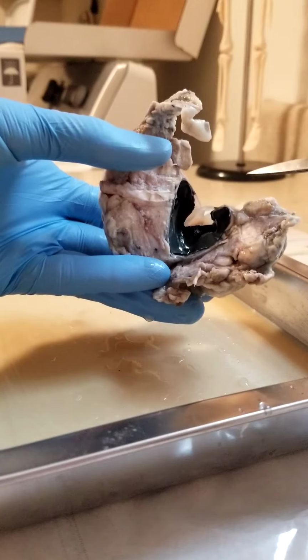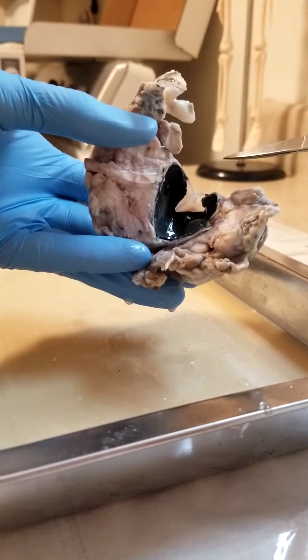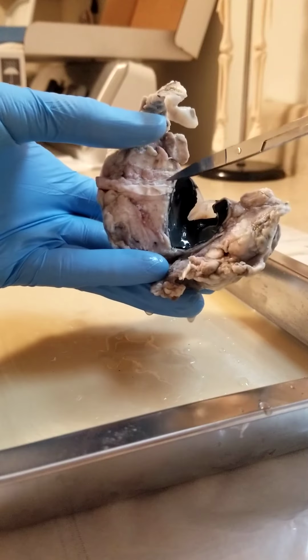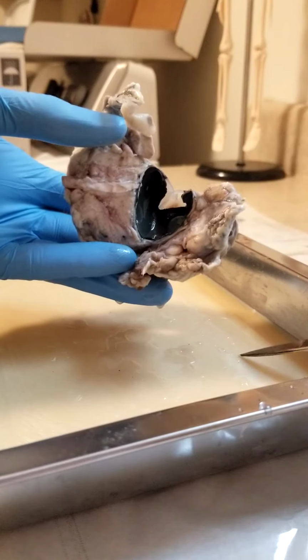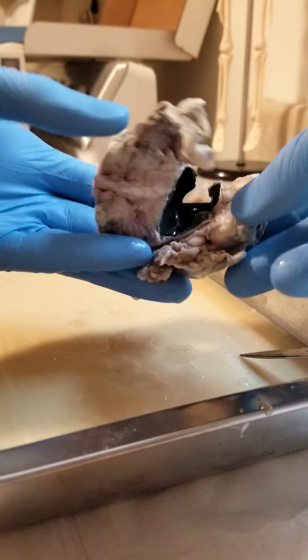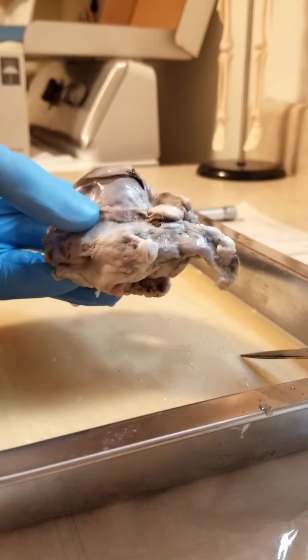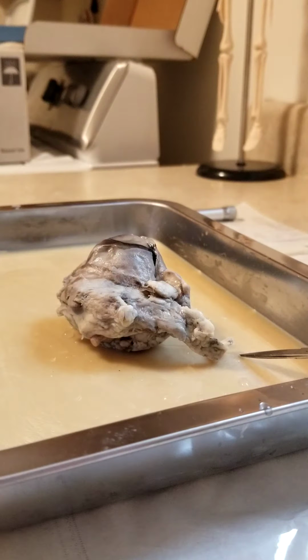The retina is a thin layer at the top there. And the choroid is going to be outside in the lower area there. So make sure I covered all those: anterior chamber, the pupil, iris, lens, retina, and the choroid. I'm going to pause it so we can go to the second section, pupillary light reflex.